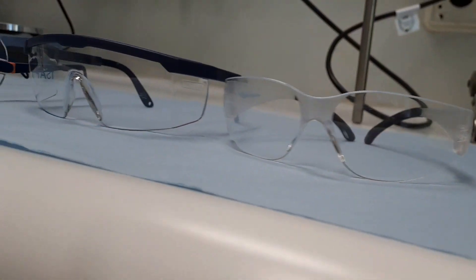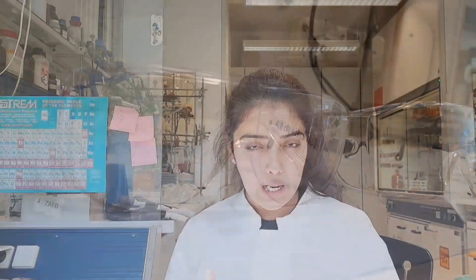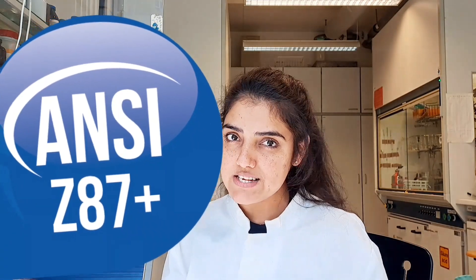There is a huge variety of chemical safety goggles and everyone has their own function and purpose. But every pair of glasses should meet the standard of Z87 for the protection of our eyes, and D3 for the protection from chemical splashes.